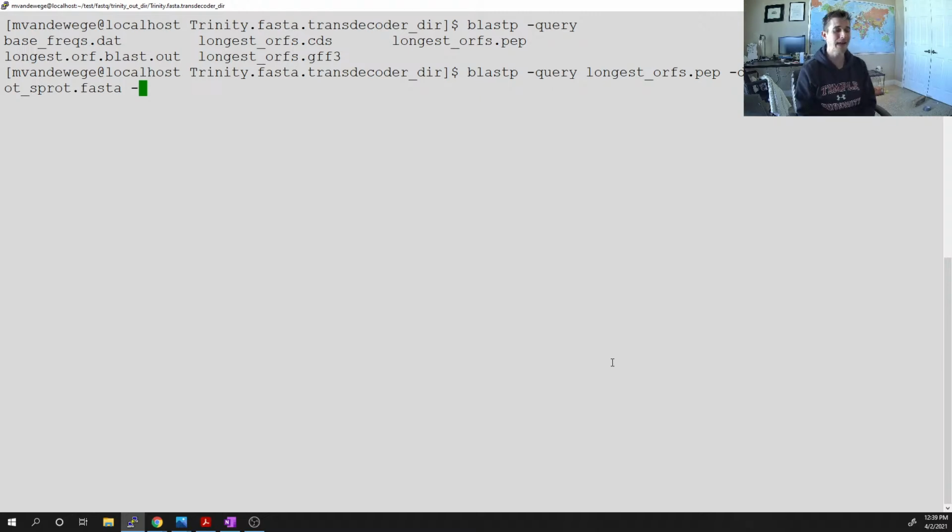And then I have to tell blast how I want this reported, because blast can give us alignments, but it's not very helpful. But we can control how the output looks by using outfmt. In which case that's going to be 6. Don't ask why, it's just going to be 6. This is a tabular output format. It's the easiest to work with when all is said and done.